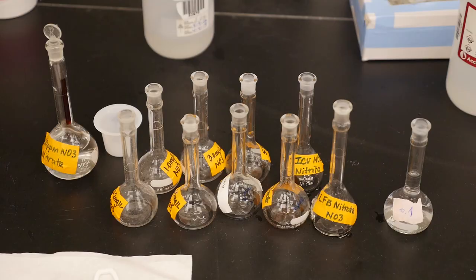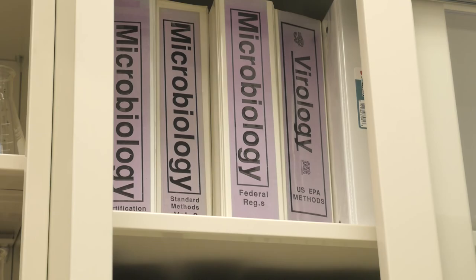With EPA, our mission being to protect public health and the environment, all of the information, all of the stuff that we do is based on our science.